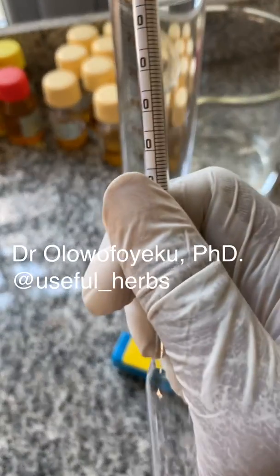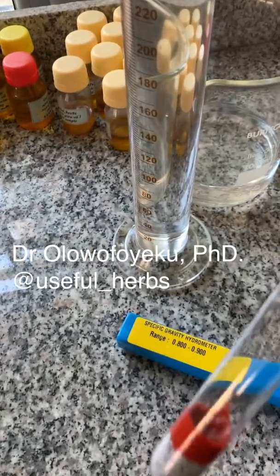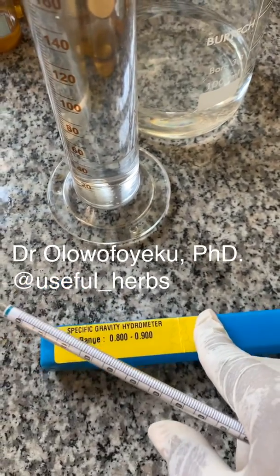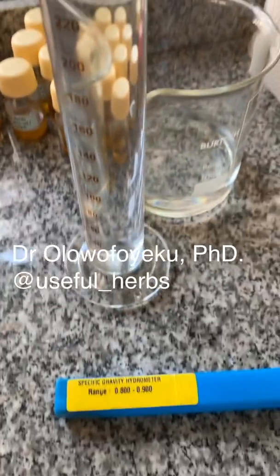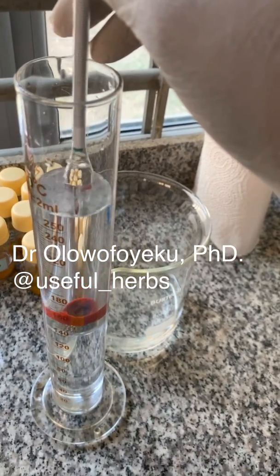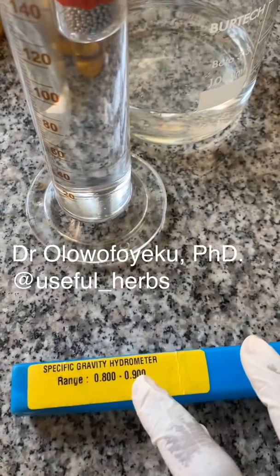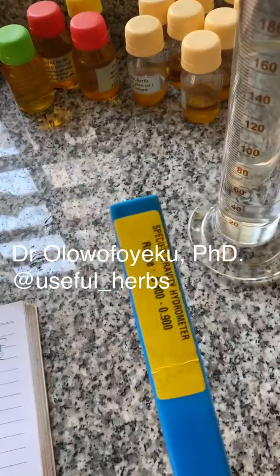I realized that the range of this hydrometer is actually 0.8 to 0.9, and the specific gravity of pure water — which is what is inside this measuring cylinder — is actually 1. So this hydrometer will not suffice for that purpose.